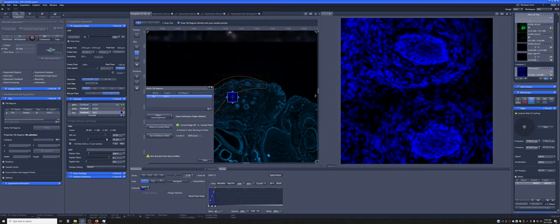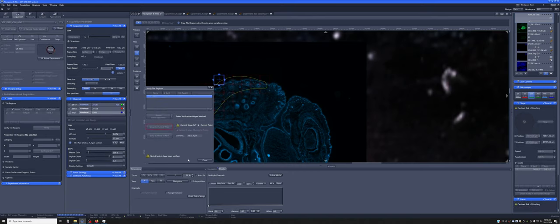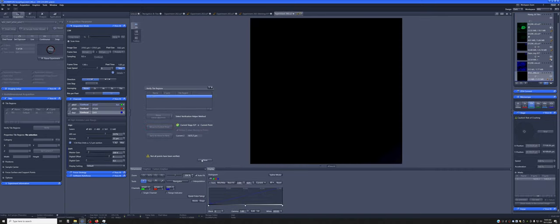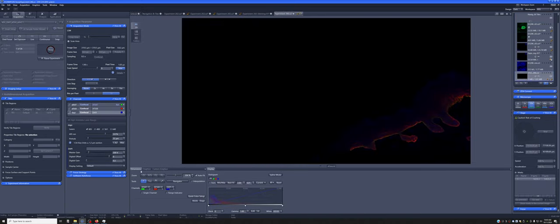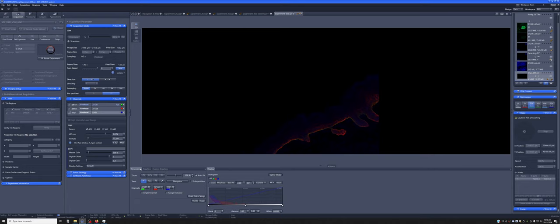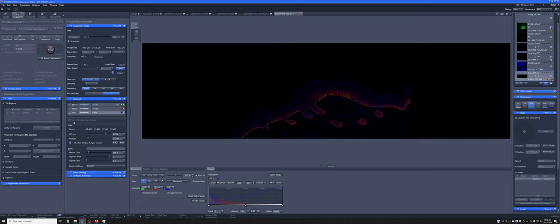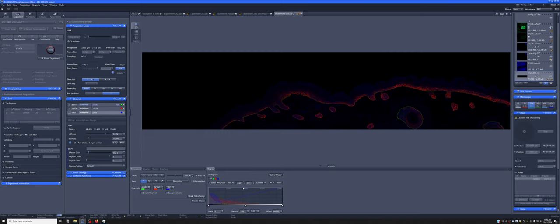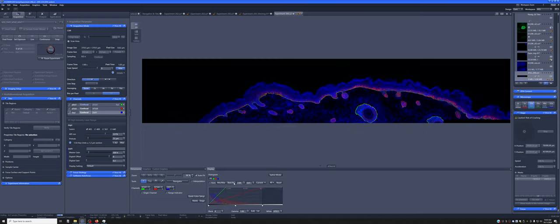That looks fine. And I'm going to say start experiment. So I actually made a mistake there. I didn't actually set the focus. But since it was fine to begin with, I think that's fine.